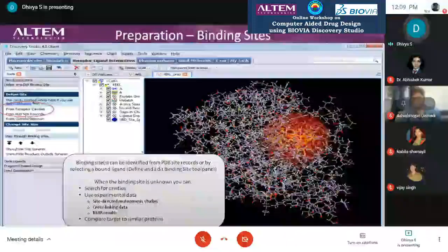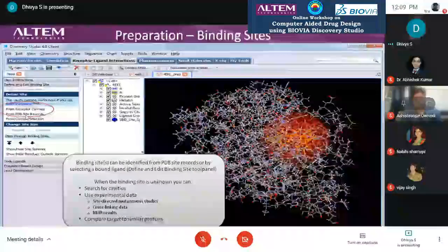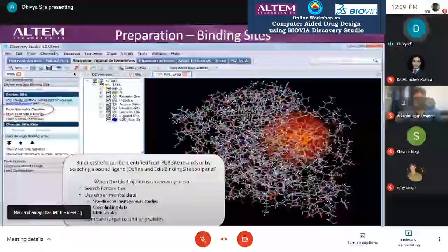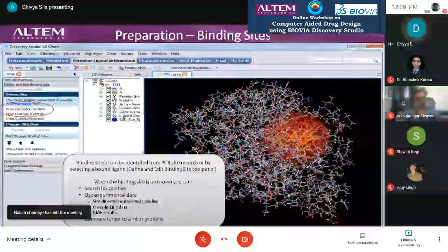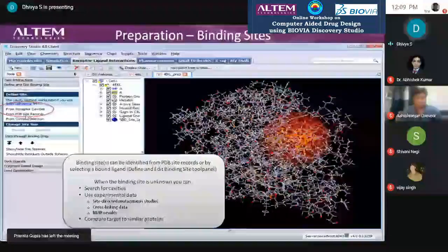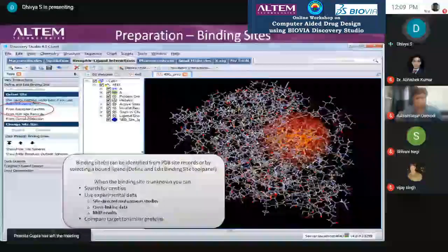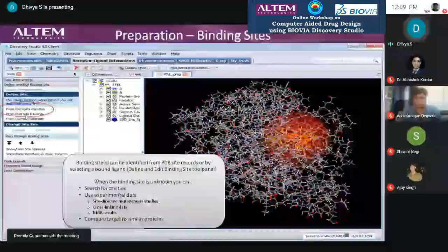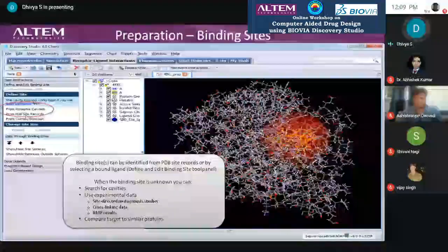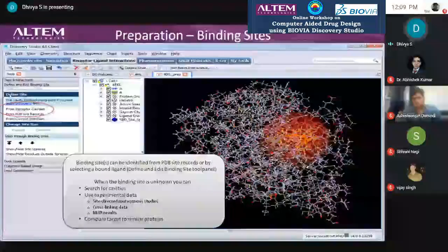I would like to dock my ligands with an already bound ligand using an NMR structure. NMR structures may have extra-personality bound ligands, and those sites are the only ones of interest. I would like to dock there — that is also feasible. Select the position, define the region over there, and mark it as a binding site. You can achieve this by means of the 'Define Binding Site' under the defined site process.